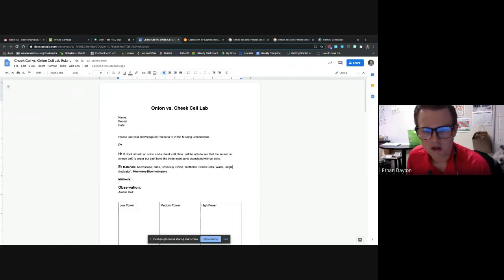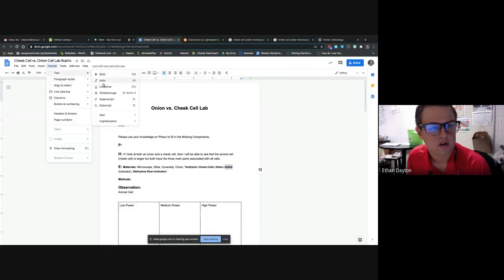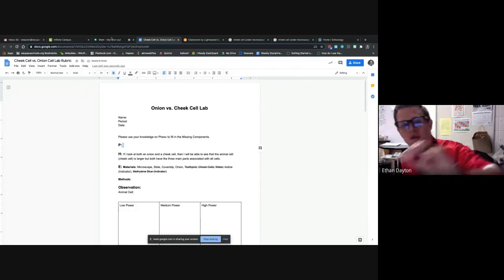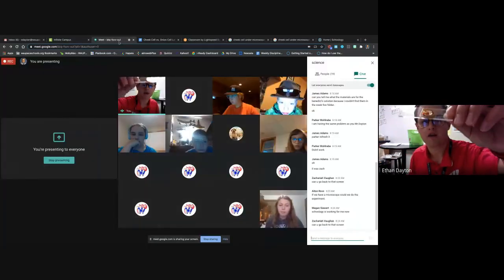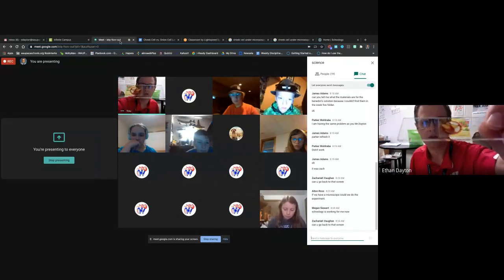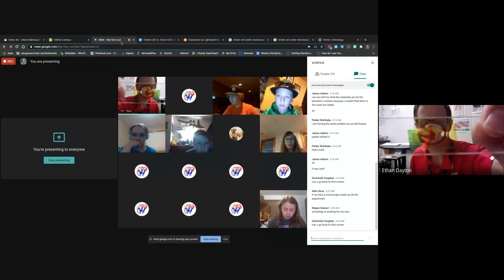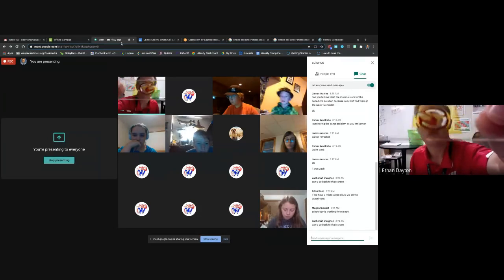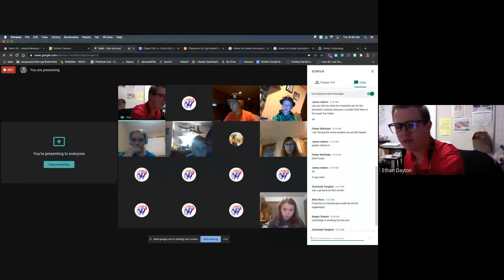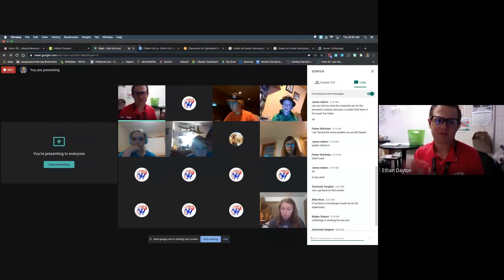We will be using, oh, sorry, I did not mean to cross out iodine. Figure it out. Okay, we are using iodine, excuse me. So you'll notice that this is stained. That is iodine. There's a piece of onion skin under this, and that is stained with iodine. Why do you think I stained it with iodine?